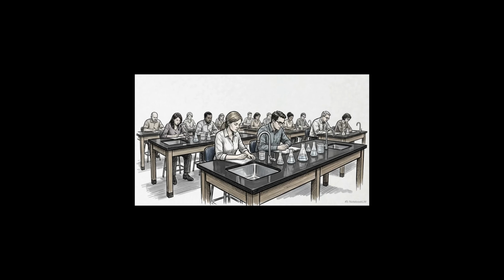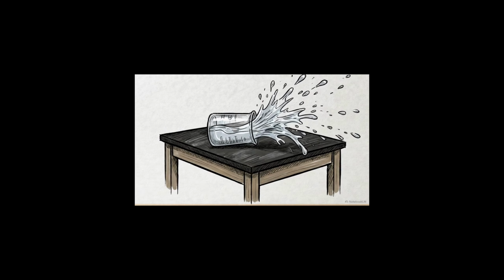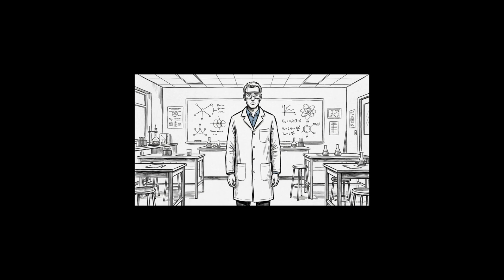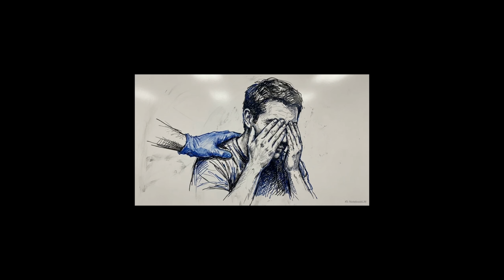Let's look at how this preparation pays off in a simulated emergency. A student accidentally knocks over a beaker of acid, and the chemical splashes directly up into their face. In this exact moment, hesitating is legally defined as nonfeasance, a failure to act. Freezing up and failing to direct the student to the eye wash station is a direct breach of your duty of care. You must step in immediately.